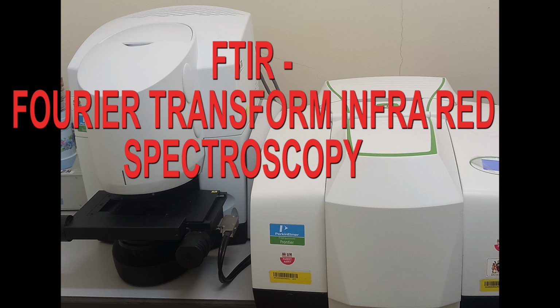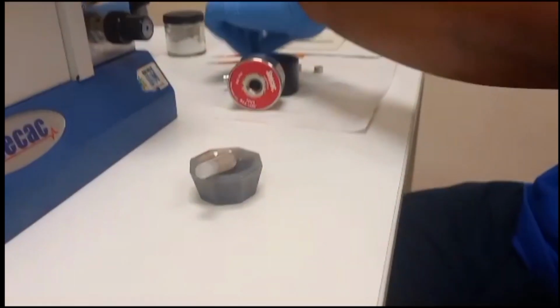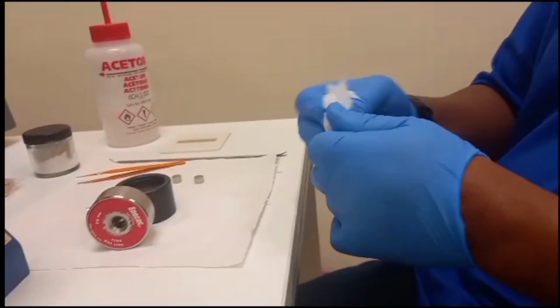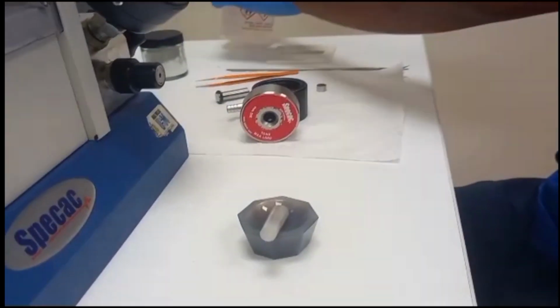The sample is prepared for analysis by either placing it directly on an infrared transparent material or by making a thin film or pellet of the sample mixed with KBr, that is potassium bromide. An infrared light source emits a broad spectrum of infrared light covering a range of wavelengths. It's usually from 400 to 4000 wavenumbers.